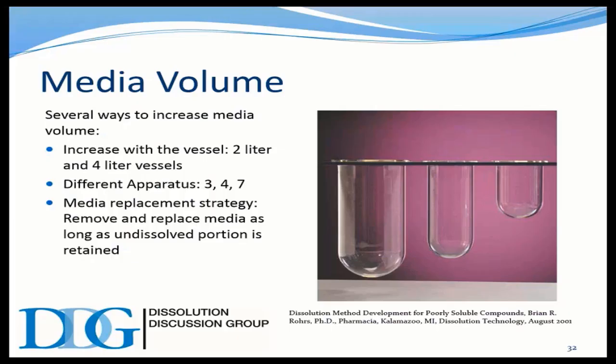Probably the most long-standing way of dealing with a poorly soluble drug is just increasing the volume. There's only so much that surfactants can do, and I don't know how many out there have tested veterinary products or bolus products, but these have a huge impact on the solubility of this maximum strength. And when you look at some aspirin tablets for bovine and equine species, these things are several inches long, and they have a tremendous amount of drug.